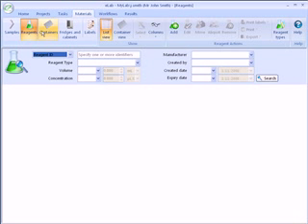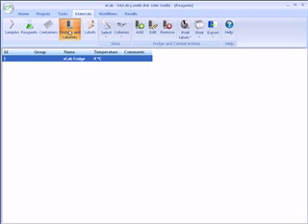Reagents, containers, and fridges are managed in a similar way to samples, and are accessed by clicking on the appropriate toggle button on the top left of the ribbon control.